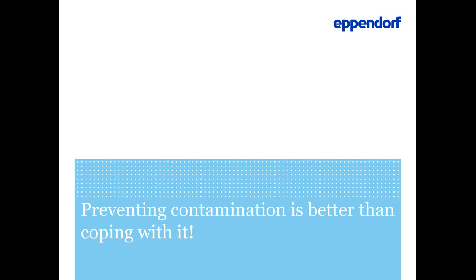Okay, there were also some questions regarding alternatives to water baths. Are there any alternatives? Of course, you can heat your samples in a different way. Some people use the incubator for heating or warming aliquots of their media. This, of course, is also a risk of contamination because you have it in the incubator, but it is not an additional water source like you have with the water bath. So that might be an alternative to that. You could also use heating blocks for tubes. So that might be a solution as well.